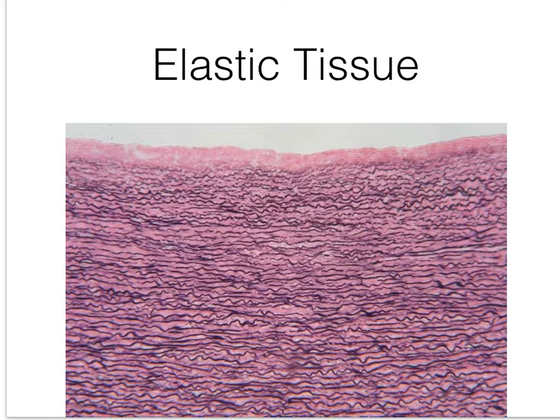And so you can see these black fibers are not collagen fibers. Collagen fibers are thick and usually stain red to pinkish. These are sort of squiggly and dark black. I can tell that this fiber is not currently being stretched, so part of what makes these fibers elastic is that as this tissue was to stretch, these fibers would straighten out and become straight parallel bundles. And then as it relaxes, they kind of coil back up.